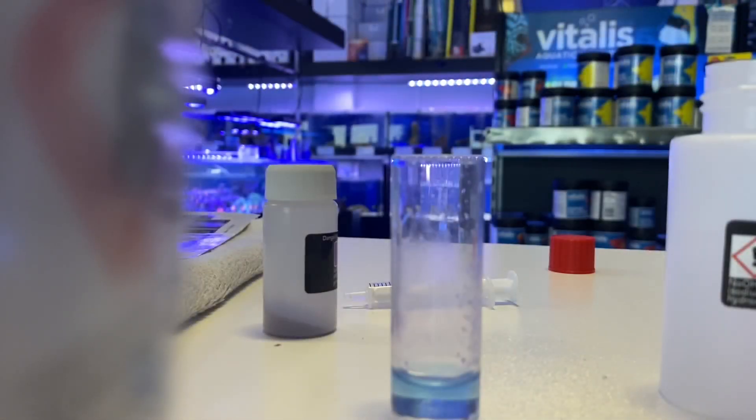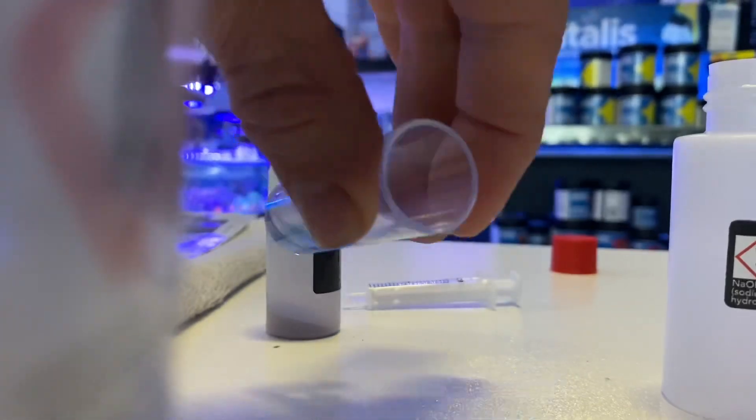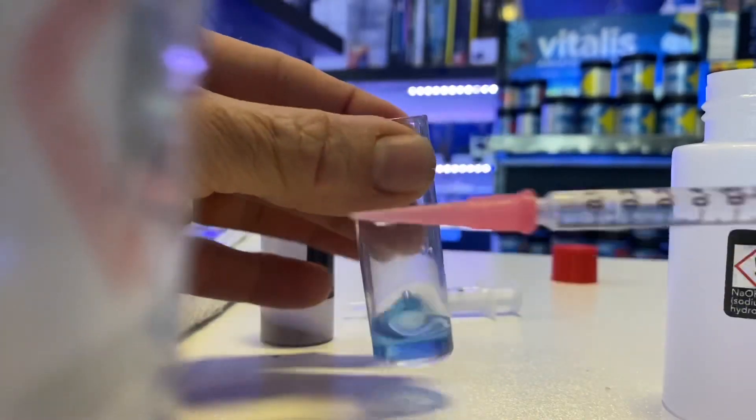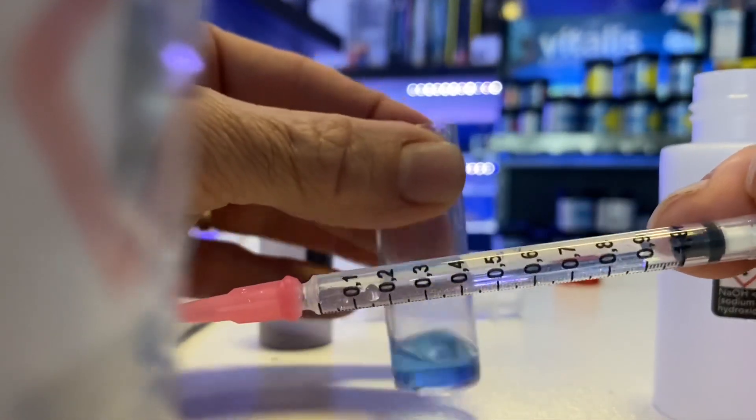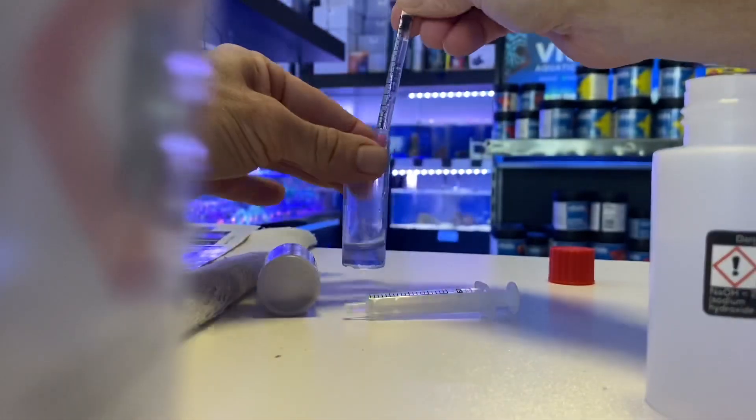So I take my vial and give it a bit of a stir. The trick is you've got to put 0.6 mil in straight up — I'll do it back here so you can see.